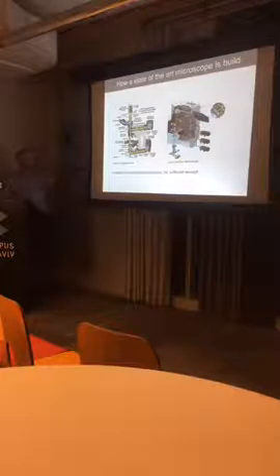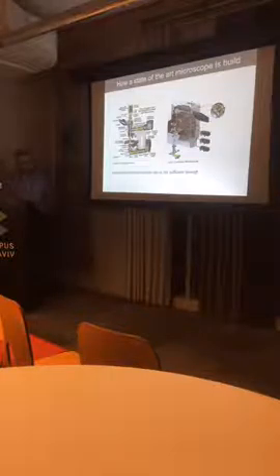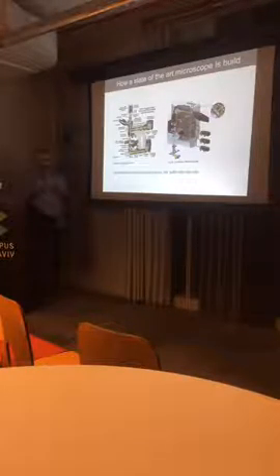Before I continue, this is how a standard microscope looks, a state-of-the-art fluorescent microscope, and this is how the confocal imaging system looks. It's not easy to build and quite expensive. But sometimes a standard microscope is not sufficient for some applications.